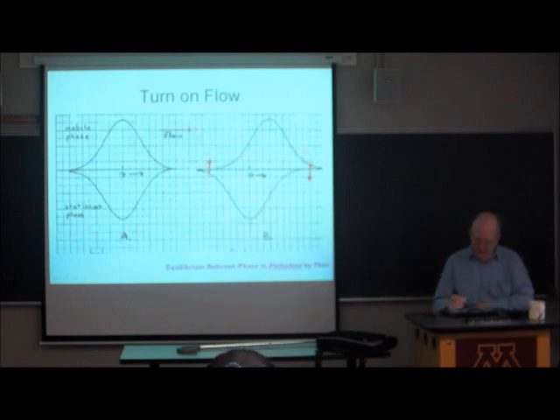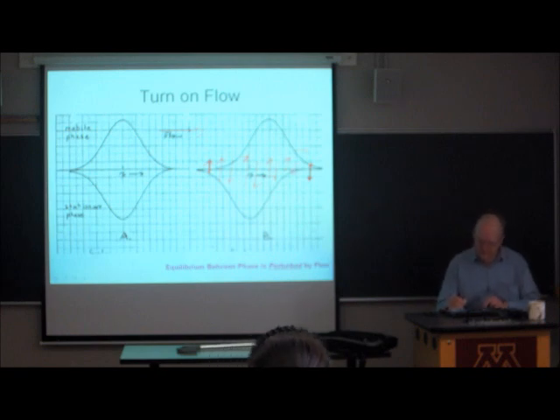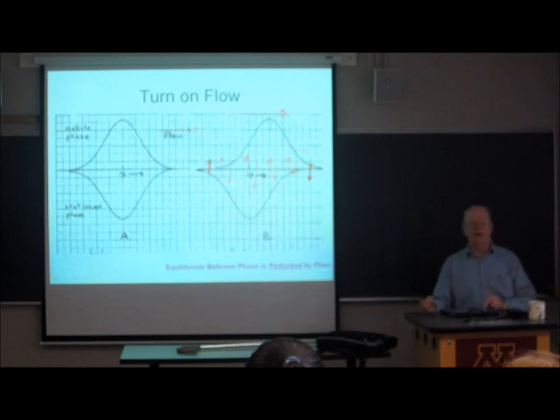So you want these processes to be very fast compared to movement along the column.